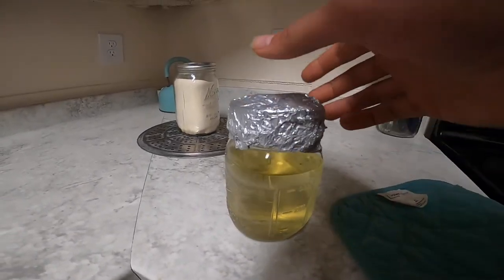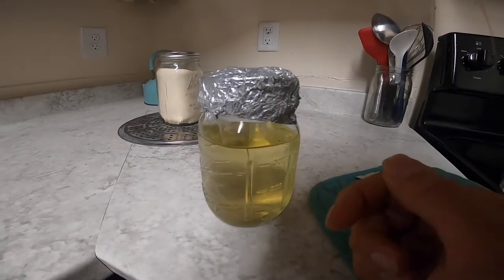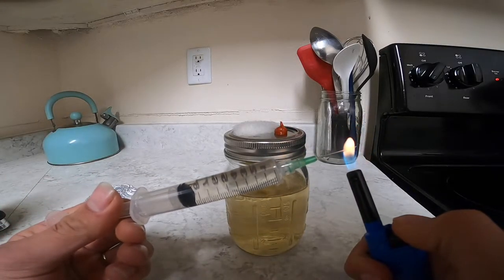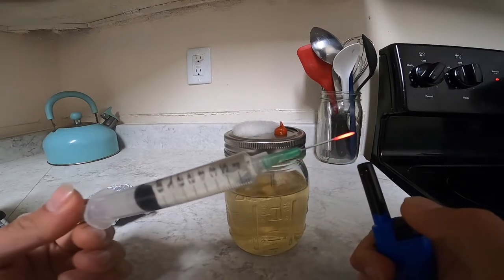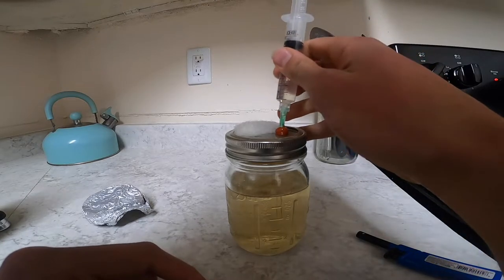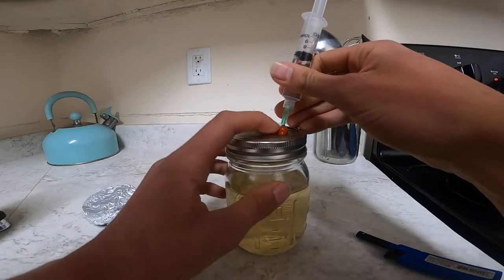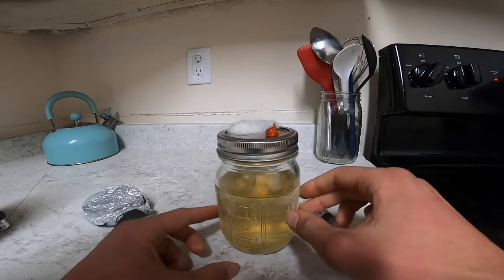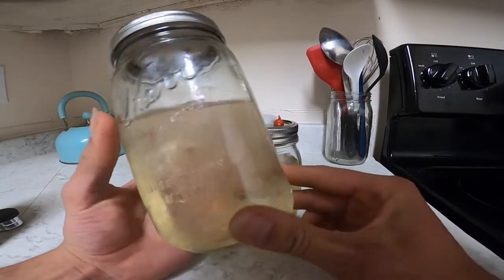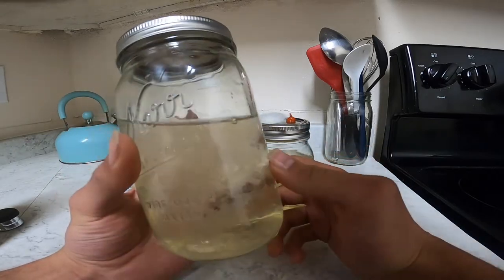We're going to let this cool down, and once it's cool we can take the foil off and inoculate it with our liquid culture or spores. When it's all cooled down and ready to go, you take your liquid culture syringe and flame sterilize the tip until it's red hot. By the way, I also sterilized the whole area with alcohol. Then push it in and inject about two CCs of liquid culture. In a few days you should see some liquid culture start building up in there. After a month or so it's going to start looking healthy — you can use it to inoculate other liquid cultures or grain spawn to grow out your mushrooms.